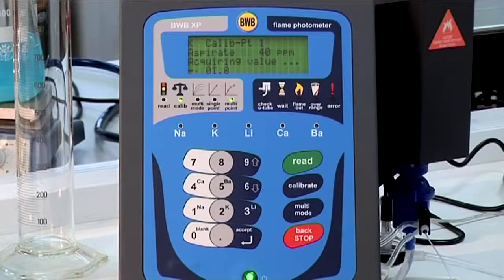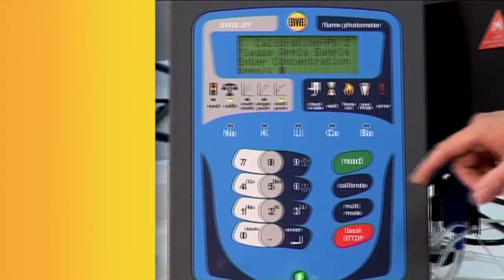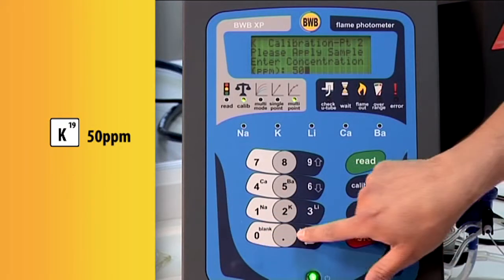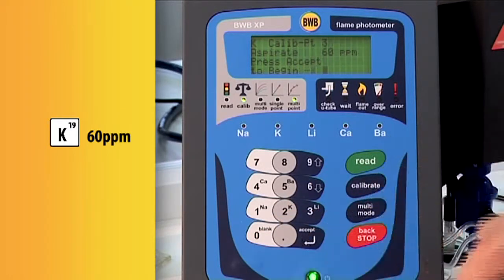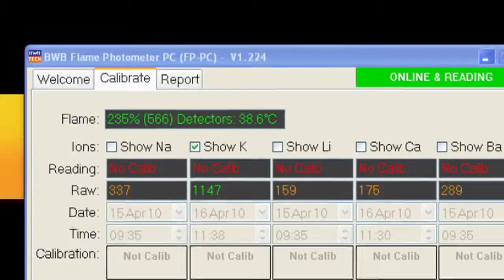The next standard is 50 ppm — key in 50 and aspirate. Our final standard is 60 ppm — key in and aspirate. We can follow the process along with the FPE PC software.